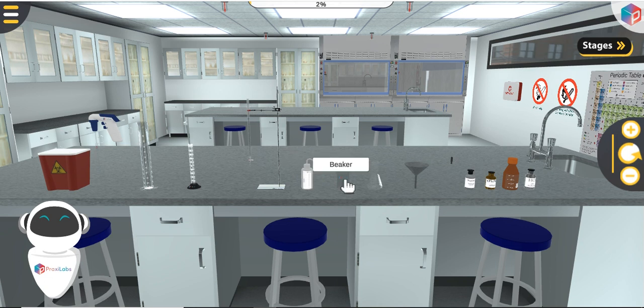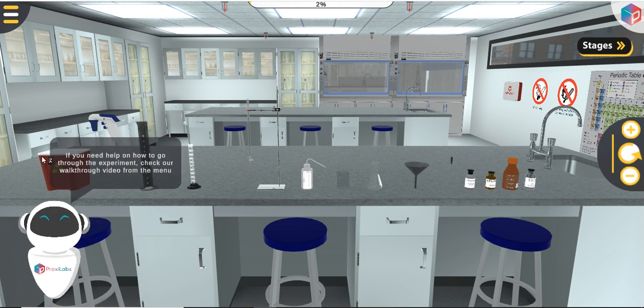Okay, here I have my deionized water. I have my beaker, my conical flask, the funnel, the pipette, and my 1 molar solution of sodium hydroxide, my amber bottle of 500 ml, and then the hydrochloric acid. Then I have the measuring cylinder here, then the graduated cylinder here, and of course here you see the retort stand and the burette already fixed there. Then again I have the bulb pipette, and of course my waste bin.